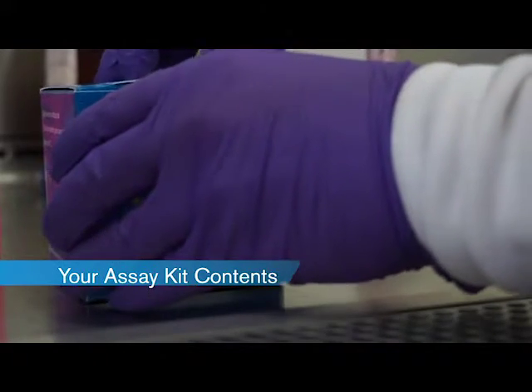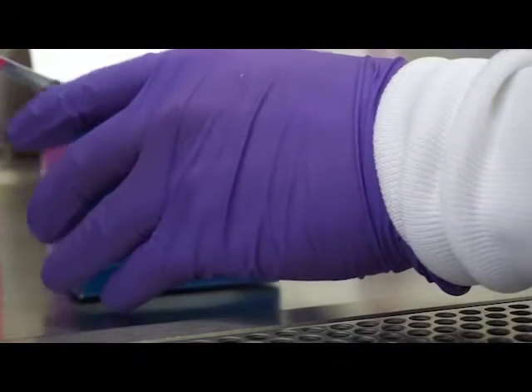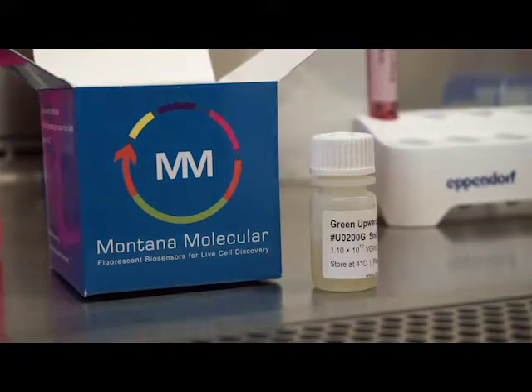All of Montana Molecular's assay kits contain the following general reagents: the sensor BACMAM stock, the HDAC inhibitor sodium butyrate, a receptor control, and an agonist that activates the provided receptor control.